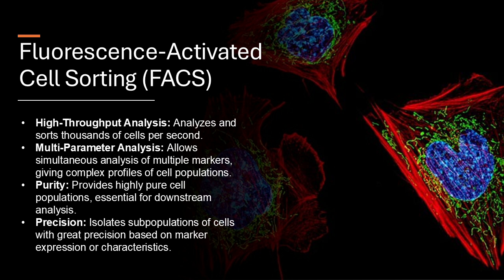Okay. And this charge determines the path the cell will take as it exits the laser beam, directing it into the appropriate container. So it's like a tiny conveyor belt, sorting packages based on their labels, except this is happening at a cellular scale. Exactly. This whole process is amazing. It's amazing that we can manipulate and sort cells with such precision.